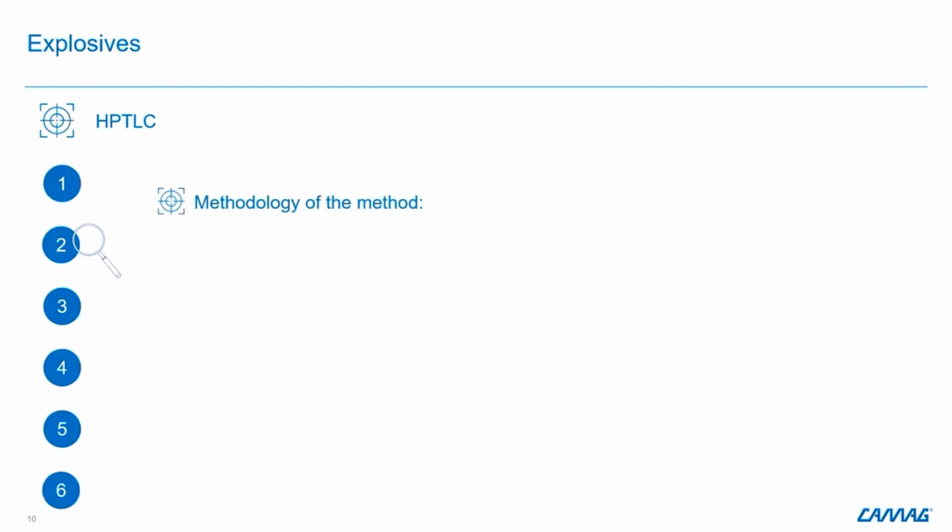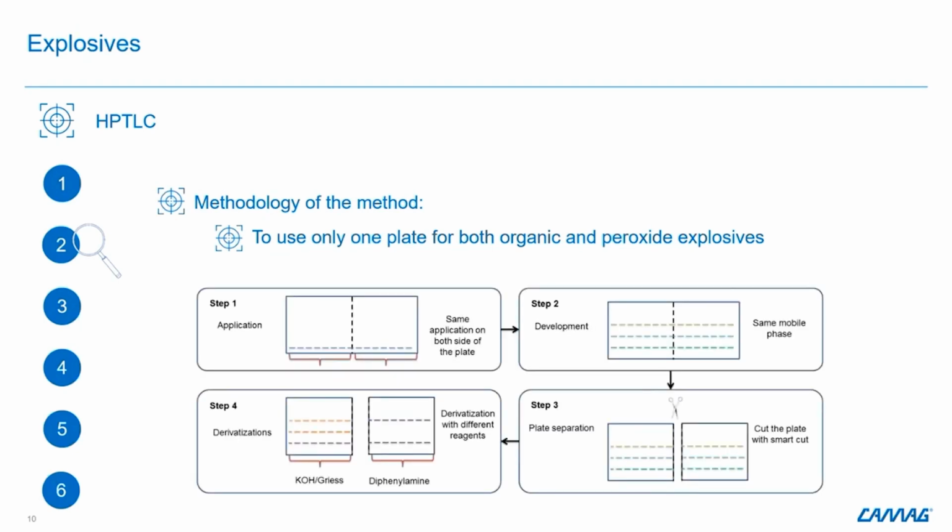For the second step, we ended up with another methodology, because the goal of our method was to use only one plate for both organic and peroxide explosives. So for that, we had the following methodology.